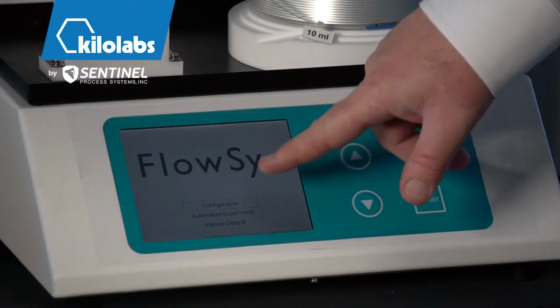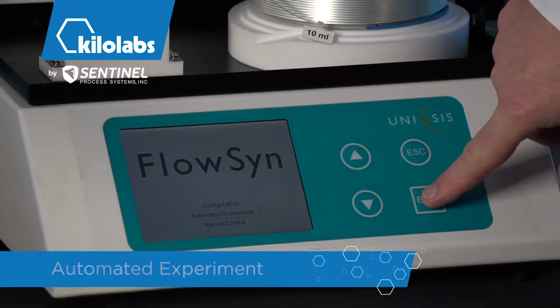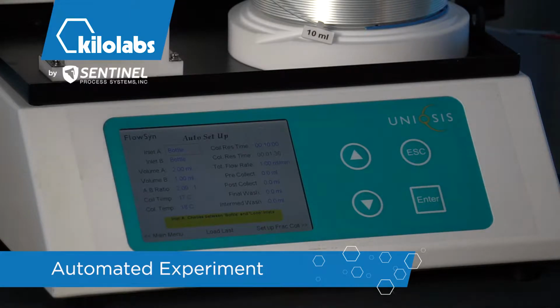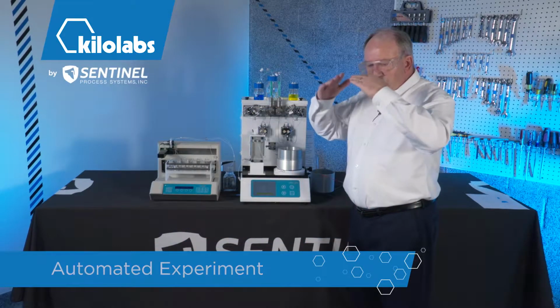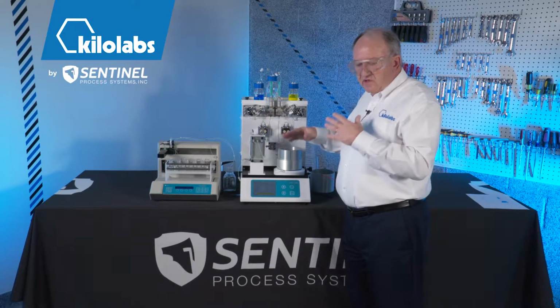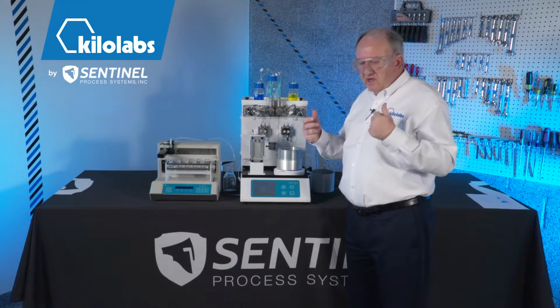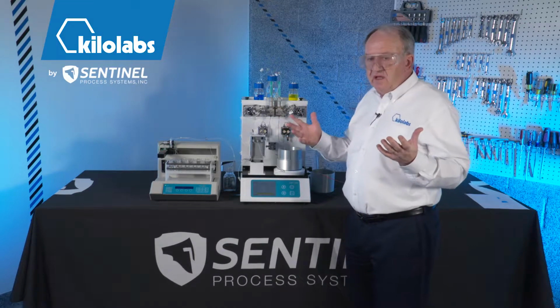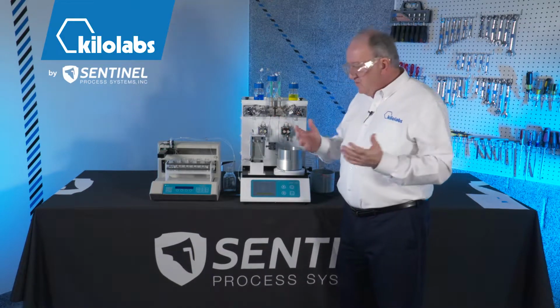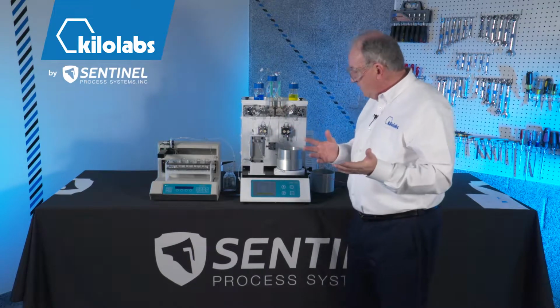So anyway, we've done configuration and manual control, so now we're going to set up an automated experiment. In setting up the automated experiment, we're setting up the first one of 10. In essence, by setting up the first one of 10, that table is filled out as though this one was copied 10 times. But again, what the researcher can do is change the temperature, residence time, or volumetric ratios, if you will, in order to determine the range of experiments that you want to do, especially if you're doing screening for a specific reaction.